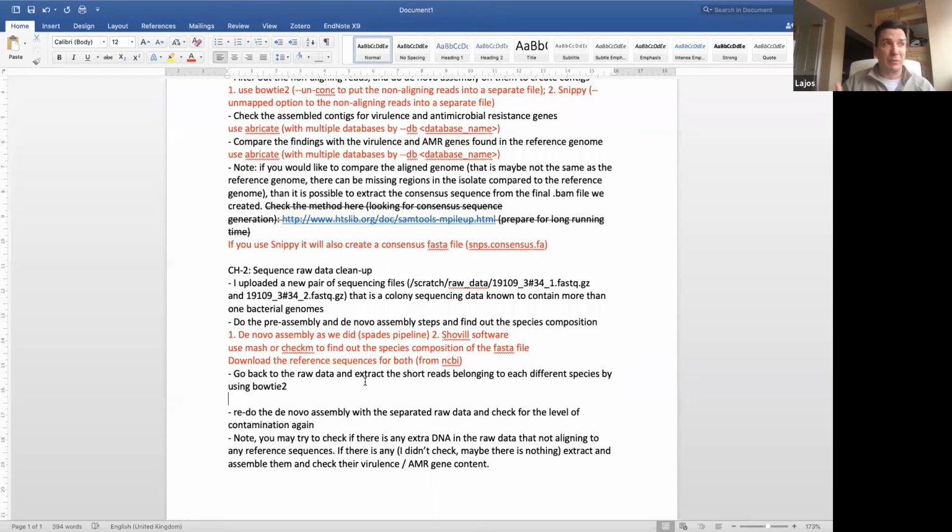It means that the bugs are looking quite similar. They are liking the same kind of culturing conditions, which potentially means that they are not too far from each other. I don't know if this is true or not, but I can imagine. I guess you cannot really grow Staph aureus and E. coli just right next to each other that easily.